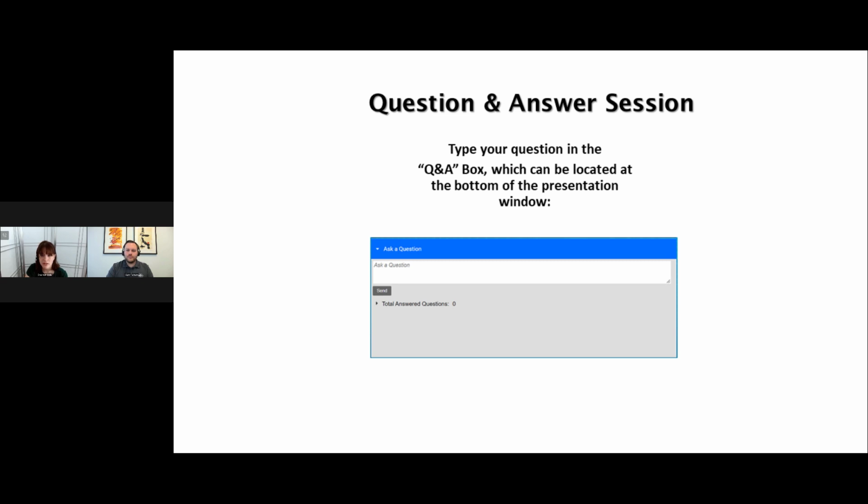So our first question today is, does using ion mobility affect the sensitivity of the instrument?